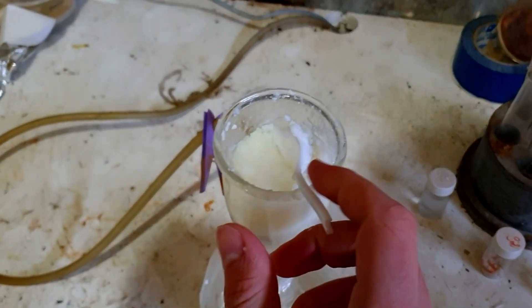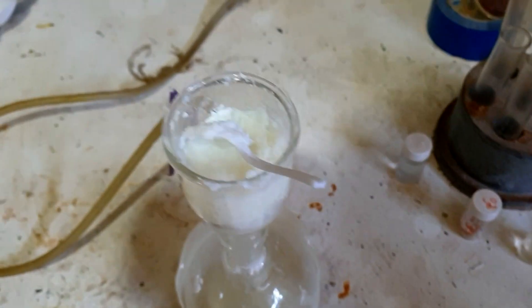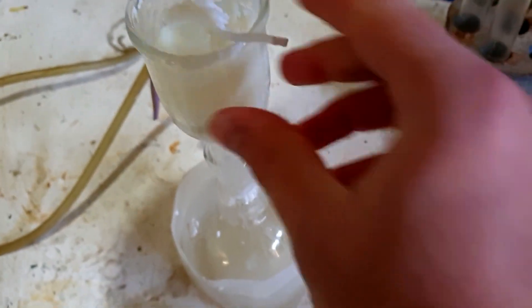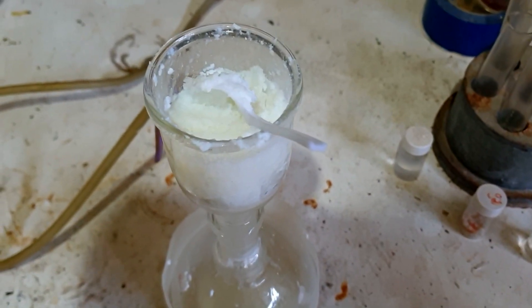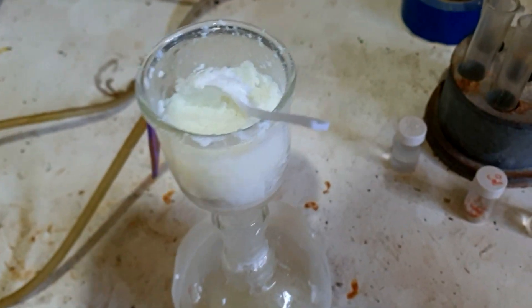It's been washed with methanol a few times and this is as dry as it's getting. It's still quite — I don't want to say soapy, what's a better word — greasy. Yes, this is as dry as it's getting on the pump. What I might do now is just take it out and heat it up and dry it — drive off the remainder of the methanol and see if we actually get something other than a waxy soap at the end of it.